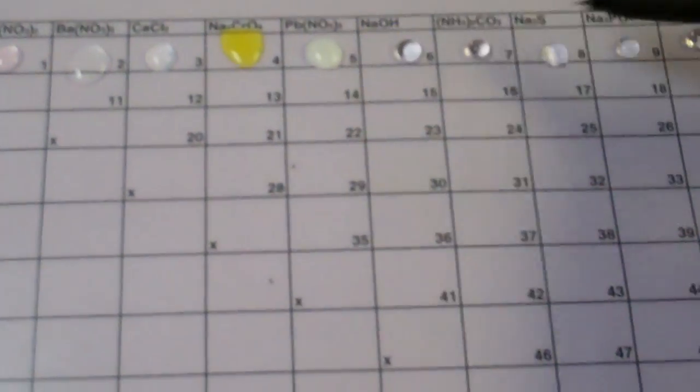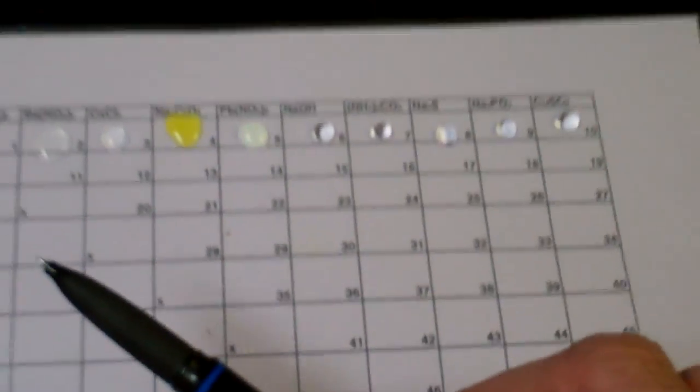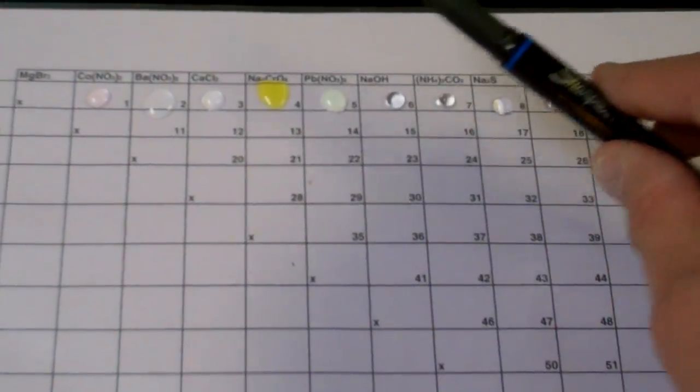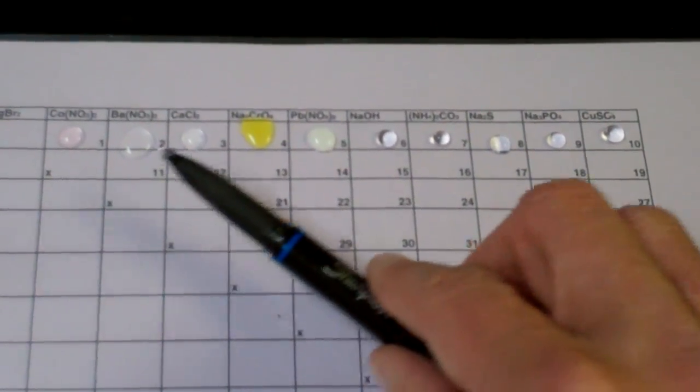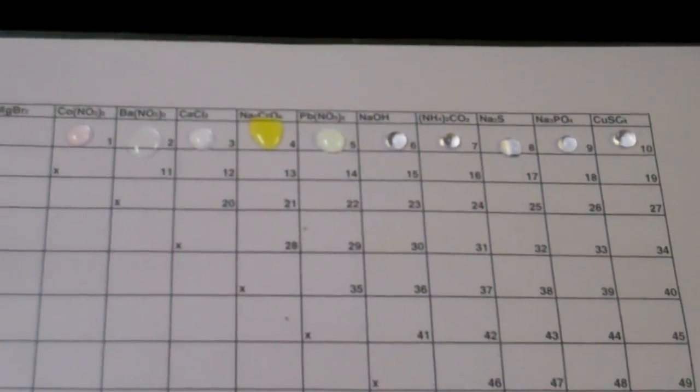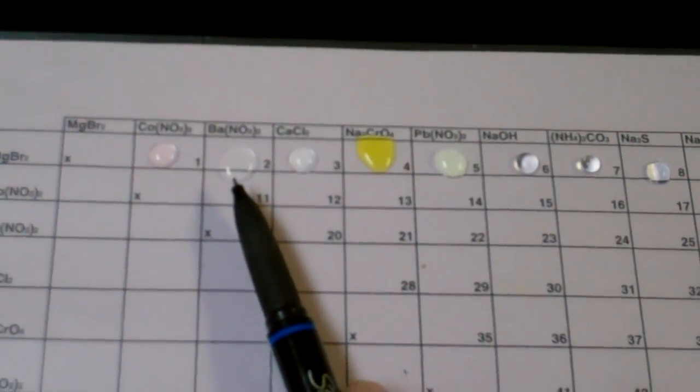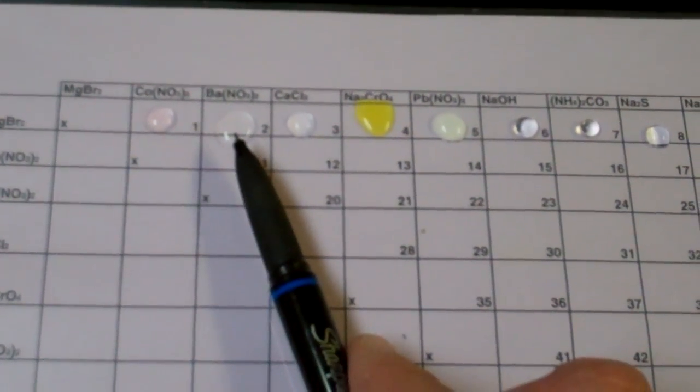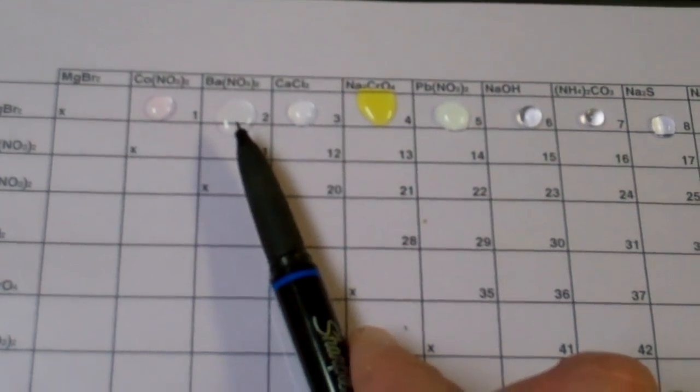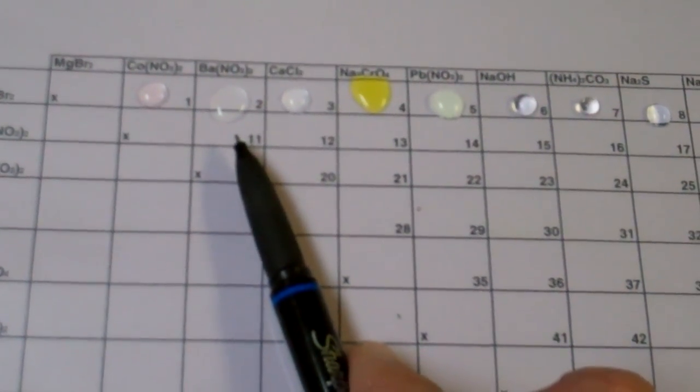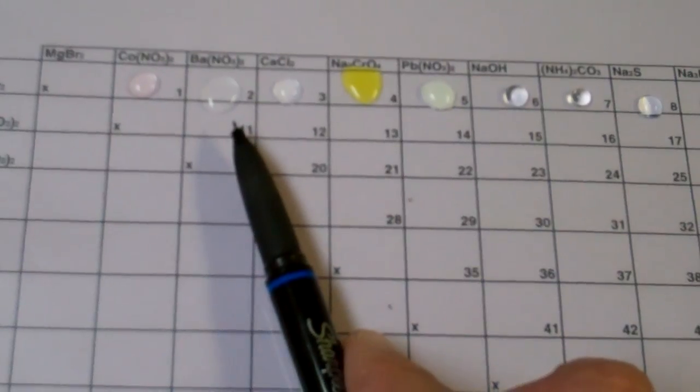Now, we'll continue that process until this entire sheet has been filled up with drops. If you make a mistake or one drop spills into another area, you can get a Kleenex out after that's been finished, and that will absorb that droplet, so it won't interfere with your next reaction.